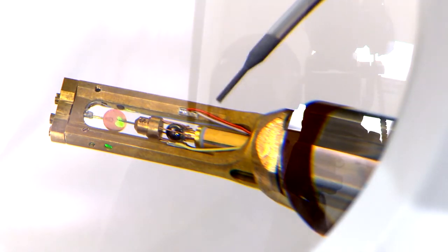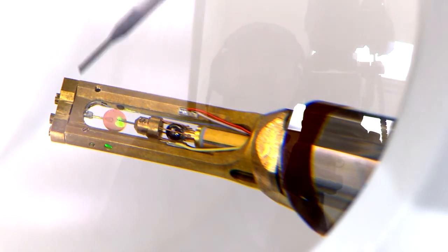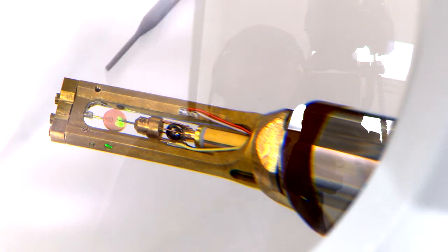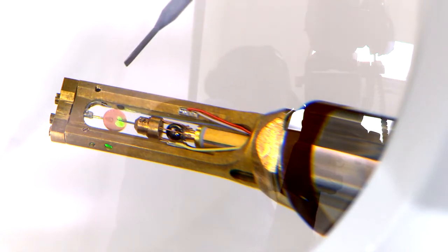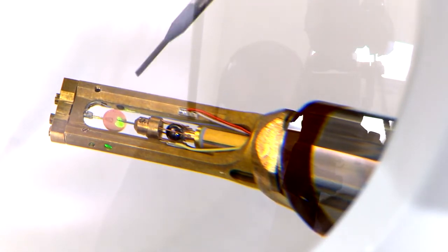This is the sample module of the MON. The light comes in on this channel, a channel drilled through here. Here, there's a very tiny mirror at the bottom that reflects it. And here you can see a green spot from laser light reflected onto the sample. The sample's held on this circular-looking bit, which is called the TEM grid. And above it, you can see a needle that is the STM tip.